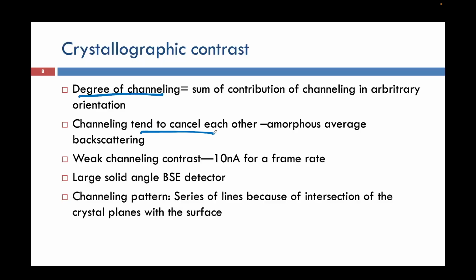That is why we have to increase the current for a frame rate. This is an experimental parameter that we generally adjust: around 10 nanoampere, we have to increase the current for a frame rate.